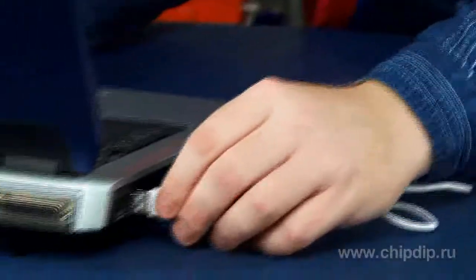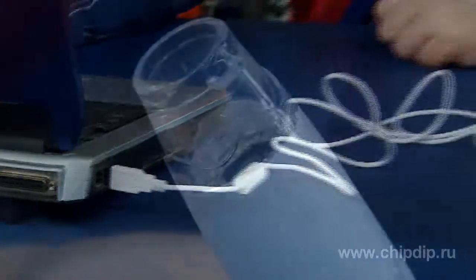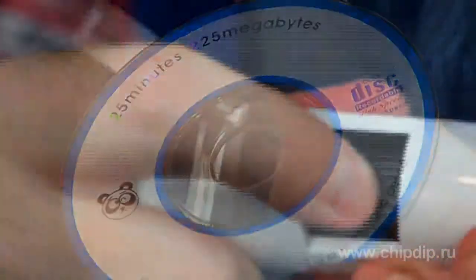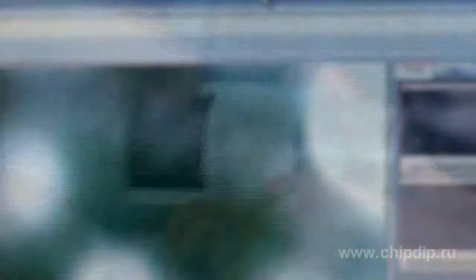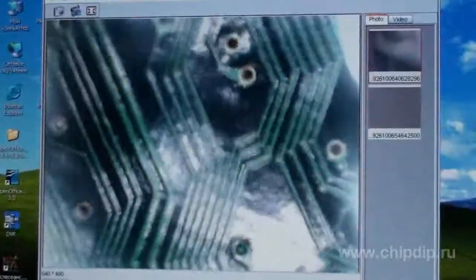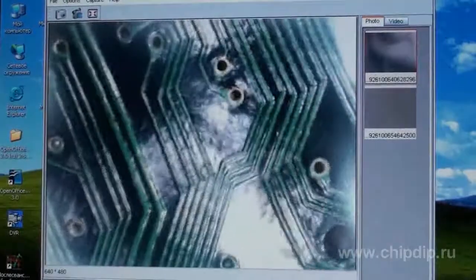The microscope has a mechanism of manual focusing and adjustment of magnification, and produces images with magnification from 10 to 200 times. We can also make a video record or photos and save them for further viewing.